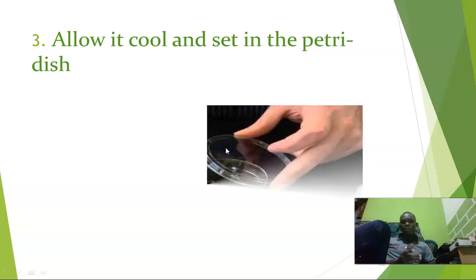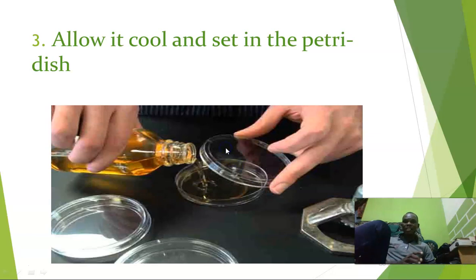It's hot stuff that we just prepared. Here is the jelly being poured into the petri dish, and you can see where he placed the cover of the petri dish so close to the petri dish. And something is here. This one is the Bunsen burner that will be emitting heat around this environment so that no microorganisms will be able to contaminate what we are doing.